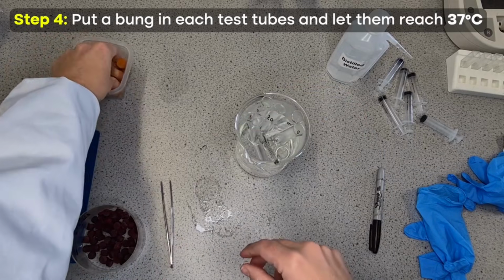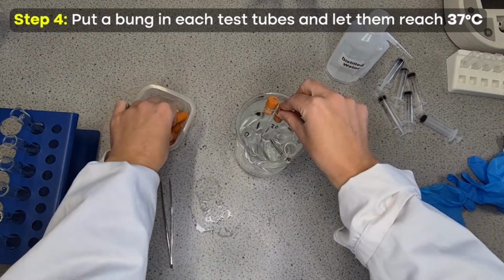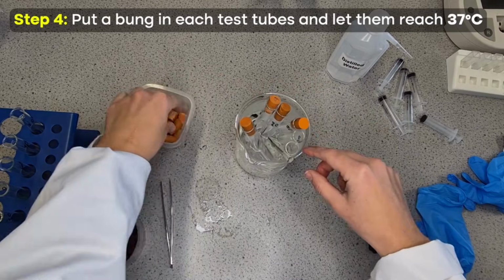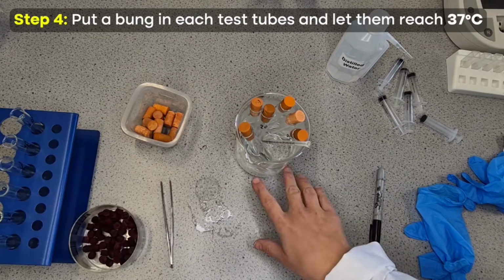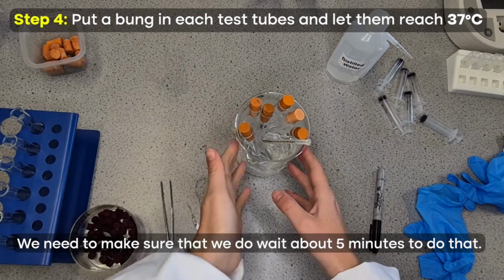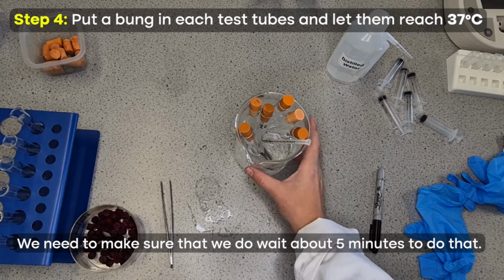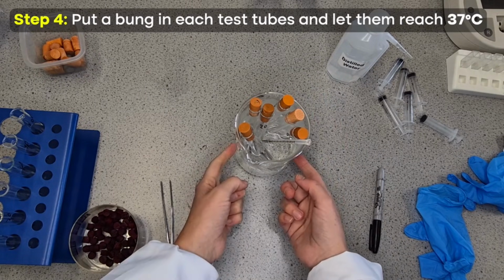I'm actually going to put a bung in all of them and let them reach the 37 degrees C. So that's now going to take a few minutes just to reach the same temperature. And we need to make sure that we do wait about 5 minutes to do that and then test, because we want to know that the solvents are actually at the temperature that we think the water bath is at.